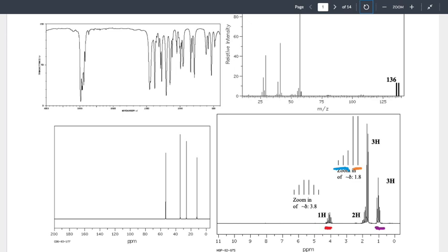The answer is yes. What's the other interpretation? Is this 3 hydrogens bonded to a carbon? Yeah. This satisfies that interpretation. If I have an integration of 3, I just have 3 HC bonds. This is a perfectly valid interpretation. Why do we not want this interpretation?